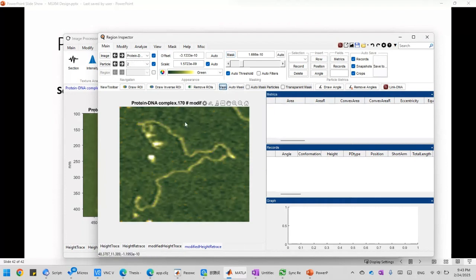Now we have another particle, DNA, here. Let's just imagine this is one that I don't know how to analyze. This could be two DNA molecules, or one singular DNA molecule, because it's kind of iffy here. They could be separated, or they could be connected. So let's say I don't want to analyze this today. It's complicated. I'm going to defer that to some other day with my colleagues to determine how best to resolve this DNA molecule. The particle set concept allows you to defer that analysis.